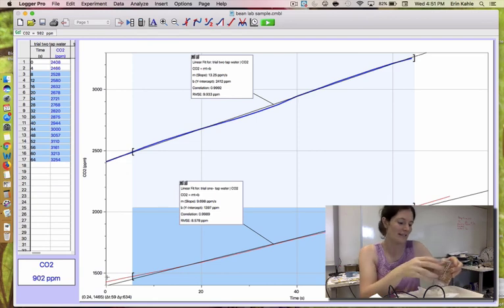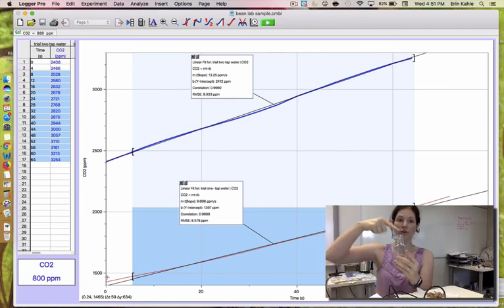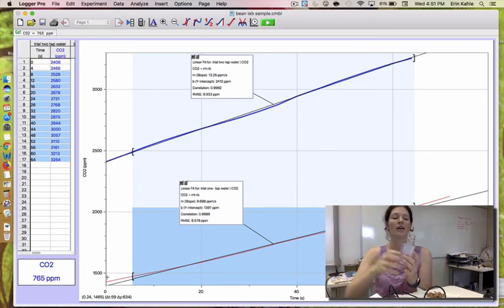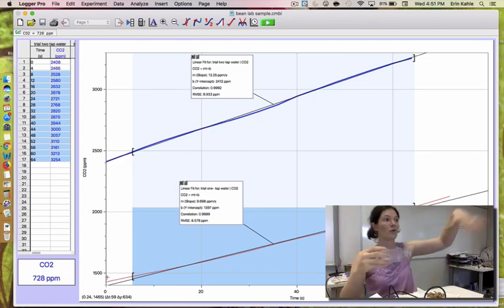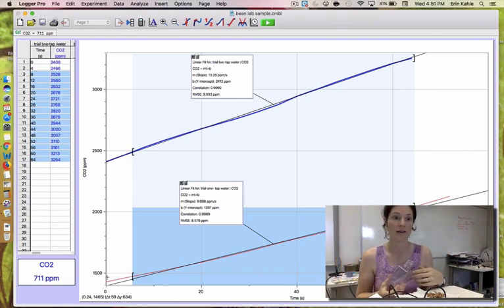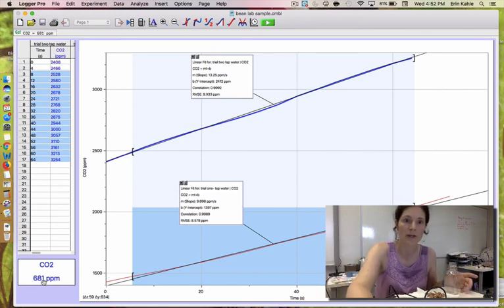But then also remember that right now there's a high concentration of CO2 in the bottle. And so if I'm going to test this again, right, so I take out these and I'm going to put in 30 more beans, I have to reset the bottle. So don't forget, in between trials, you're going to fill the bottle with water, and filling it with water is going to push out all the air. Then when you dump the water, the bottle will reset with the normal air in the classroom. Oh, actually, that's interesting. Yeah, so now we have a lower parts per million.